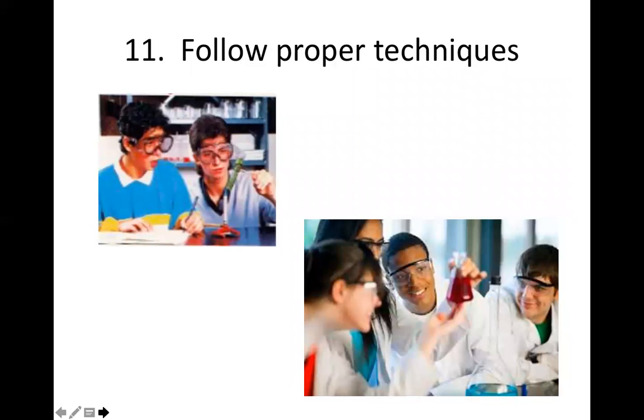So when we give laboratory experiments, we give you a set of procedures. And these procedures are chronologically arranged. So you have to follow these procedures step by step. So in the first procedure, if it says label, you have to label it. Please do not skip reading the procedures because it's very important and can really prevent accidents from happening.